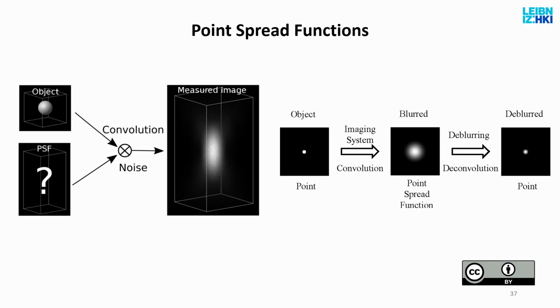But what I would like to have is, if I know the resolution of the microscope, and I know the optical properties of my sample, I would like to know what the optimal image would look like, despite all the mistakes that the microscope adds to the image. So I would like to know that if this is my sample, the real object, and this is what I see in my microscope, what did the microscope do to my image, and how can I then, from this image, calculate what the actual object looks like?